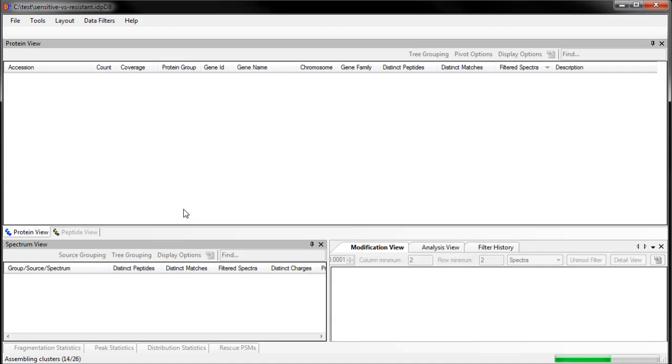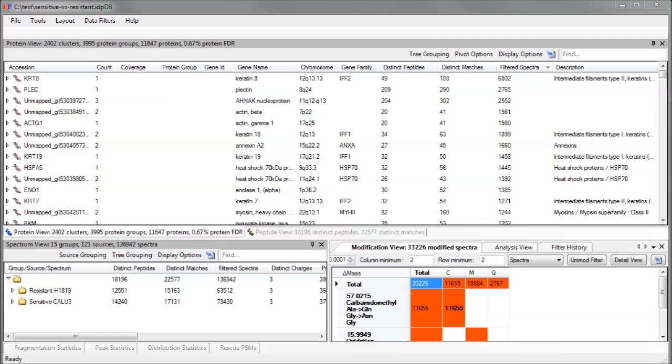You may be wondering what happens to the proteins that don't have a gene mapping. They are given a gene ID prefixed by "unmapped", so each unmapped protein gets treated as its own gene. Unmapped proteins happen for several reasons. It may be a predicted protein, indicated by XP instead of NP in the RefSeq protein accession. It may be a protein in your database that has been removed from the RefSeq to HGNC mapping database. Or it may be a new protein that doesn't have a mapping yet.